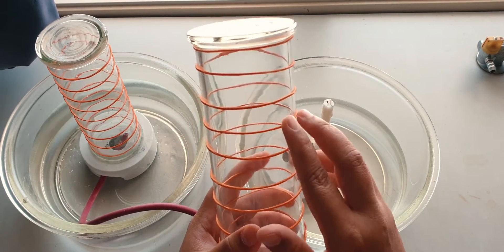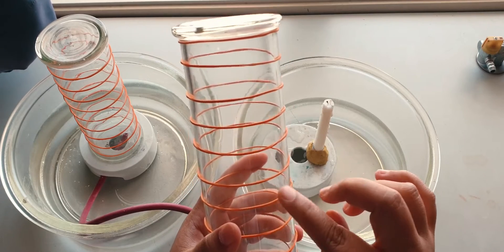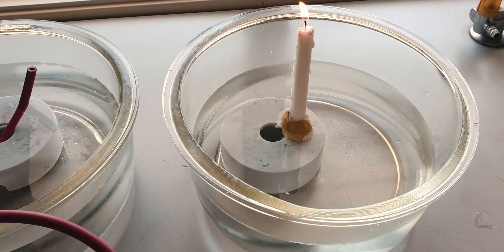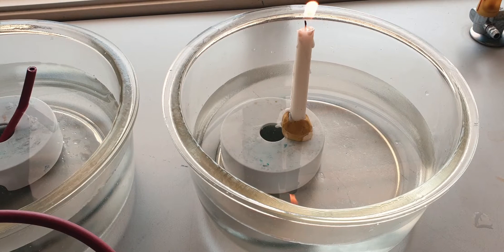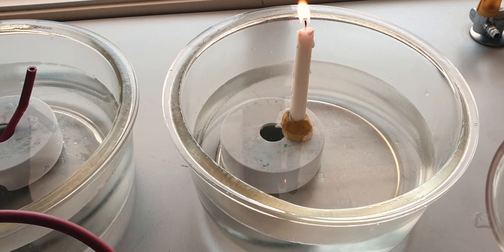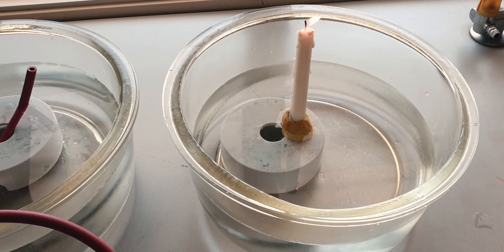Then light up the candle and invert the gas jar that contains inhaled air onto the candle. Since the inhaled air is the same as the air that we breathe in that surrounds us, so we just collect the air around us and just invert them onto the candle.